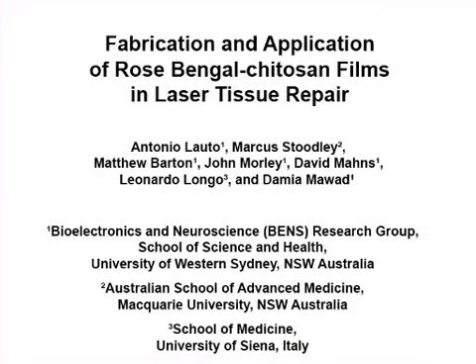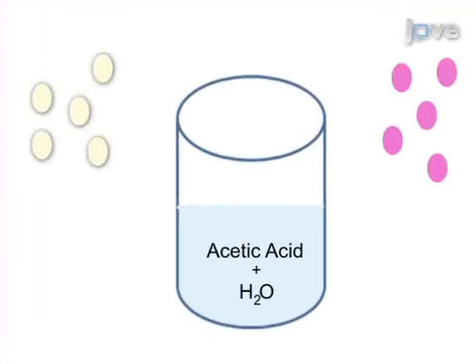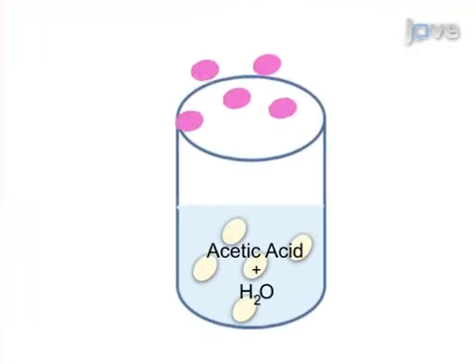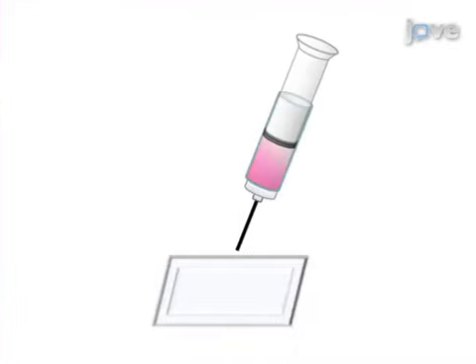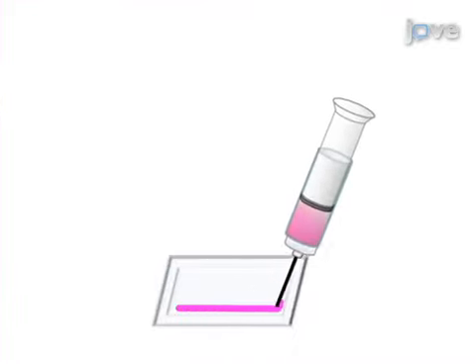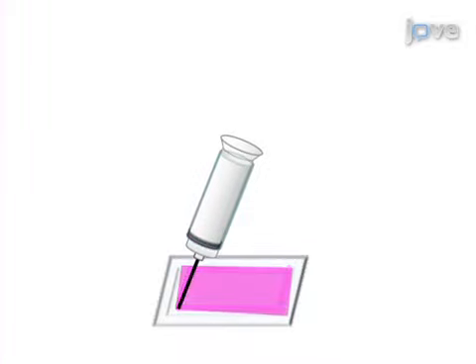The overall goal of this procedure is to fabricate a laser-activated chitosan adhesive and illustrate how to apply it when repairing peripheral nerves. This is accomplished by first solubilizing chitosan and rose Bengal powder in acetic acid solution. The second step of the procedure is to dry cast the solution to obtain a thin film.